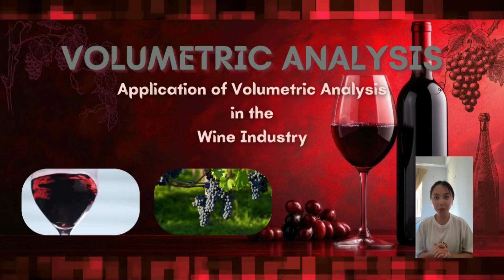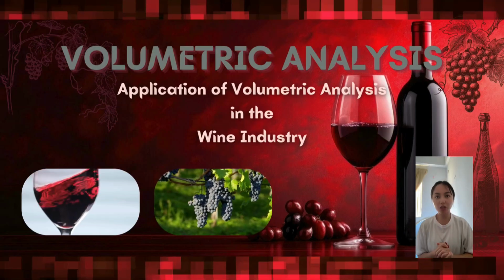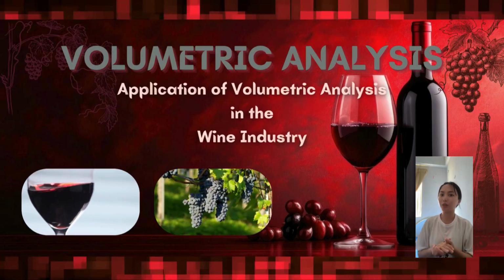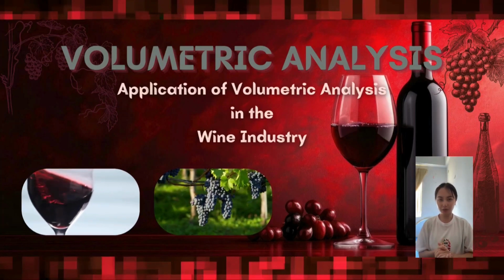Today, my group and I will be presenting about volumetric analysis and its application in the wine industry. This topic is not only relevant in chemistry but also in real life industry like food and beverage.